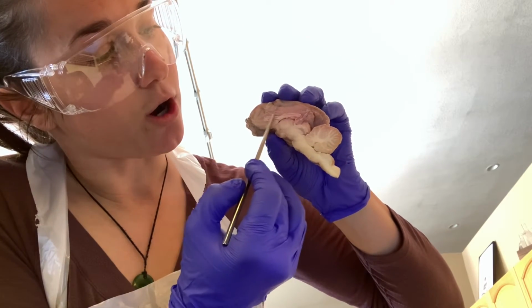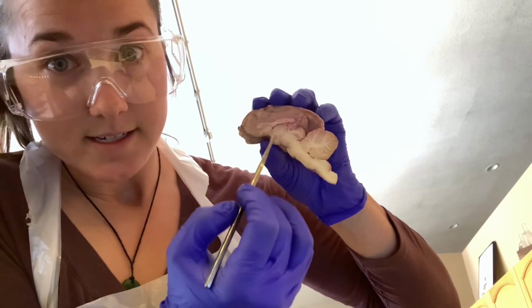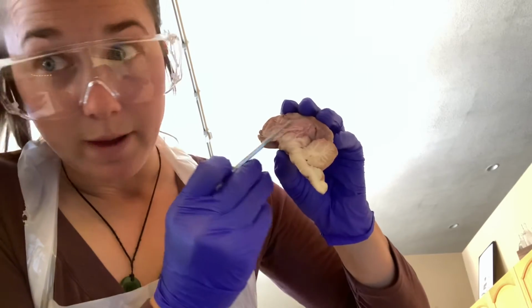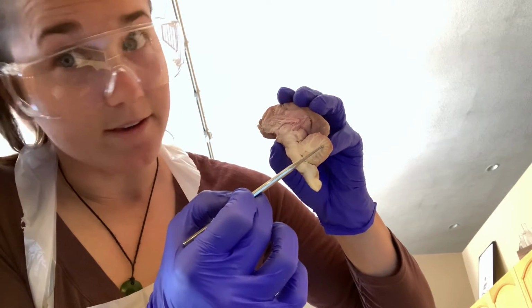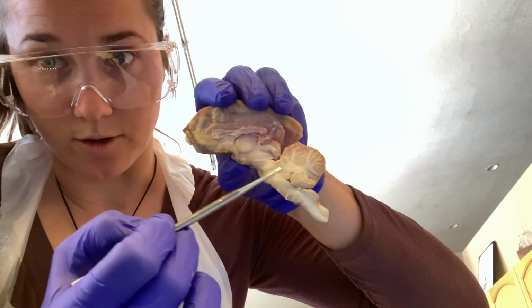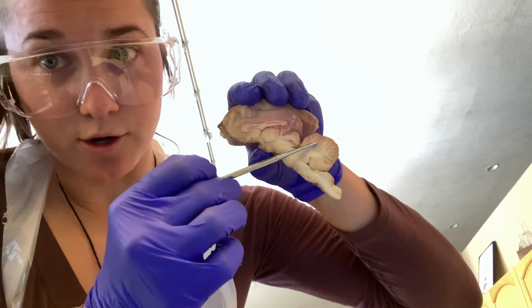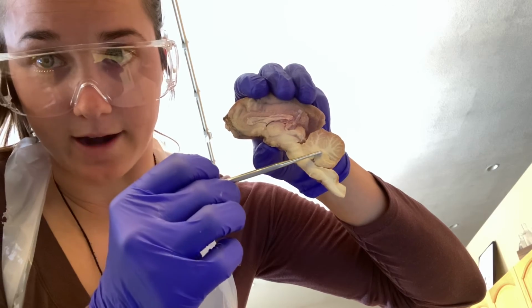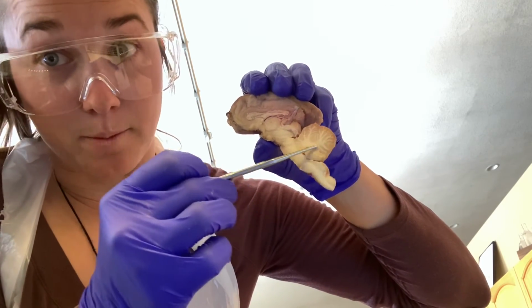And then this long flat surface here, this is called the corpus callosum, and this connects both hemispheres of the brain together. Moving back down, we have the cerebellum, and you can see the different colors and the branching within the cerebellum. The darker portion here, this is called gray matter, and then the lighter portion here, this is called the white matter. And the white matter is made up of the neuron axons that are myelinated.